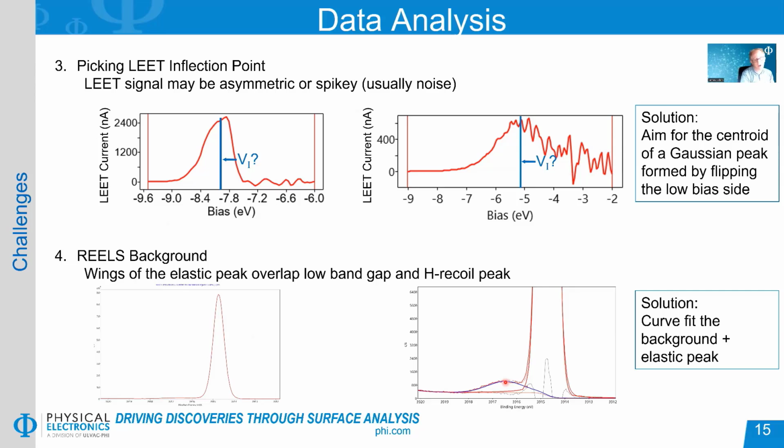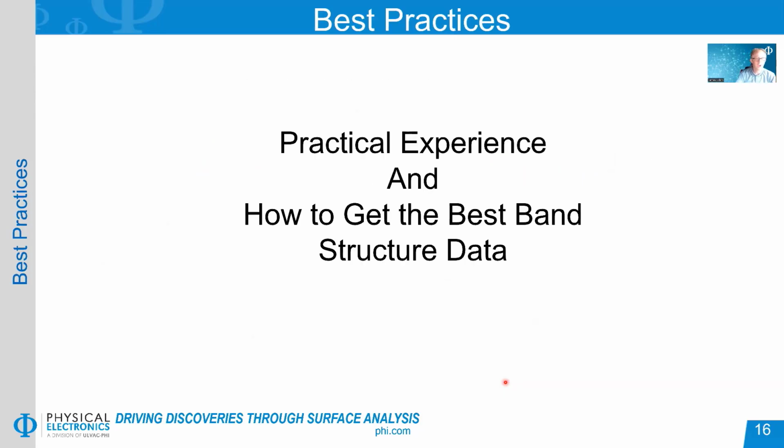All right, before we wrap things up, I just want to share a little bit of my practical experience with these techniques and some ideas that you can set yourself up for success to get the best data possible when you're interested in getting a band structure measurement. This is going to be primarily focused on UPS and LEIPS.